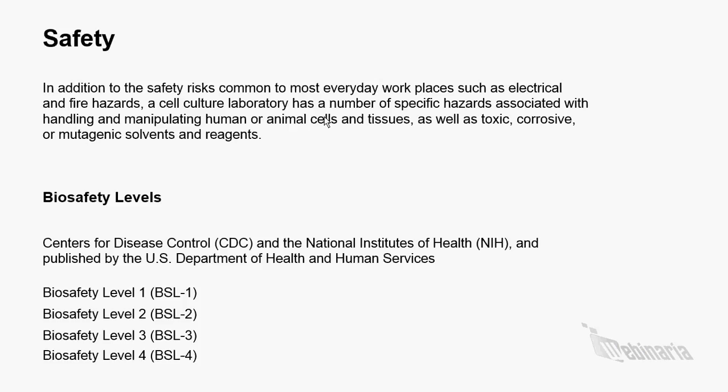There are some levels of biosafety parameters, which can be BSL1, which is biosafety level 1, 2, 3 and further 4. BSL1 is the basic level of protection common to most research and clinical laboratories and is appropriate for agents that are not known to cause disease in normal healthy humans. So BSL1, where no disease.